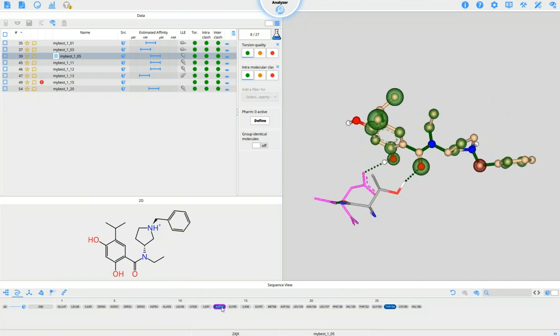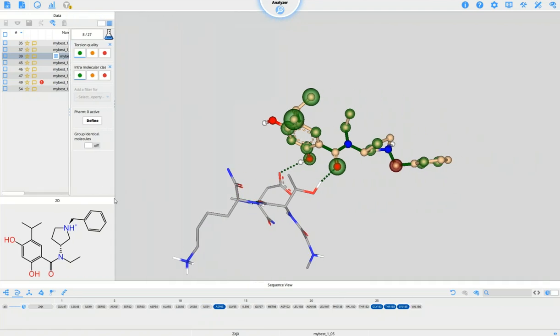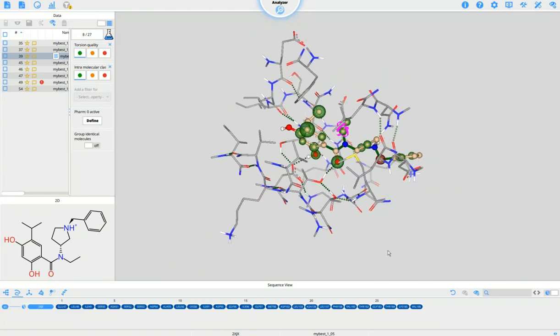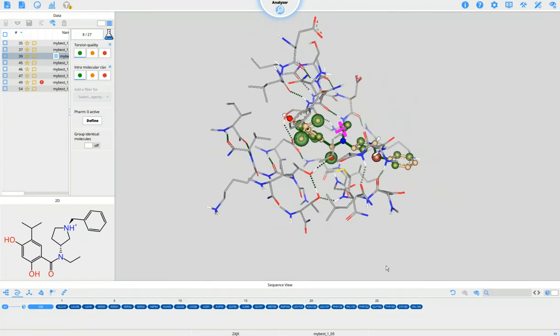I can add further if I say, okay, I want to close the gap here a little bit or add 2, 3 more which are of interest. I don't know, this one, for example, this one. And lots of people ask us, so how do I make a good picture for the publication? I turn them on again because I think it's a little bit nicer like this.